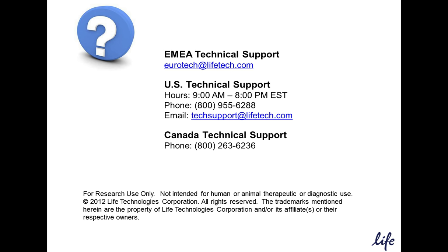People in flow cytometry tend to use direct labeled antibodies because it allows for an easier multicolor setup. If you do an indirect label, you have to do it systematically, and it takes much longer.